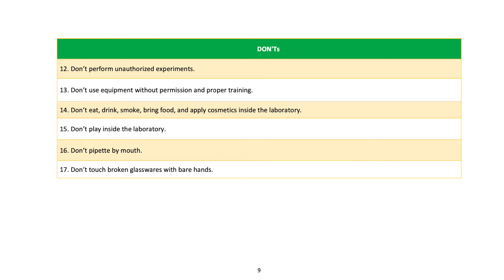What not to do: 12) Don't perform unauthorized experiments. 13) Don't use equipment without permission and proper training. 14) Don't eat, drink, smoke, bring food, or apply cosmetics inside the laboratory. 15) Don't play inside the laboratory. 16) Don't pipette by mouth. 17) Don't touch broken glassware with bare hands.